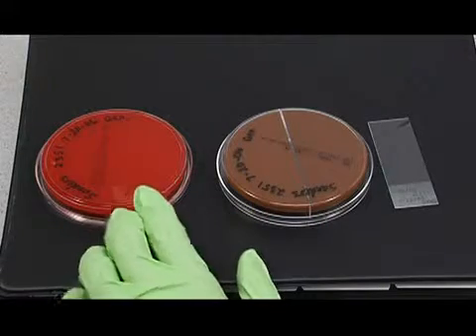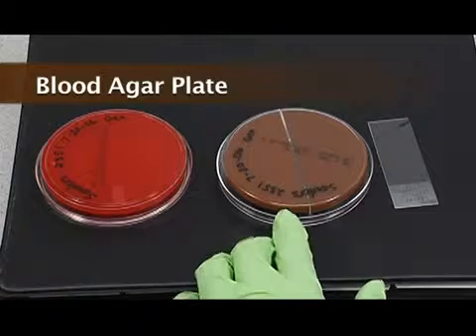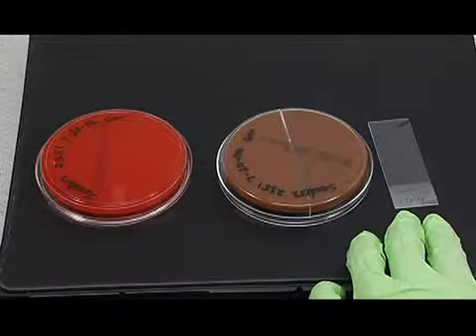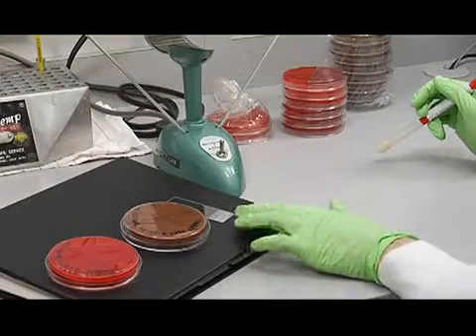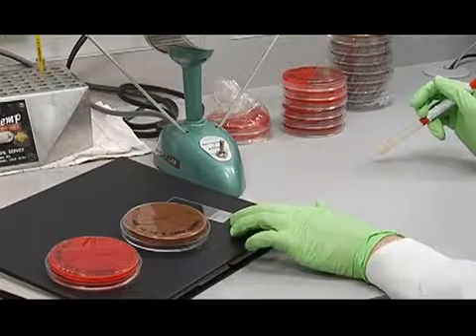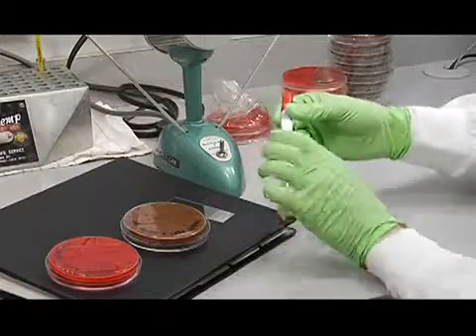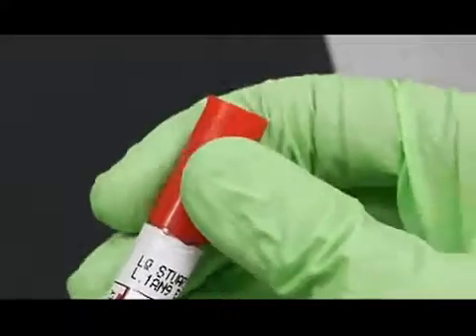So we're going to set this female genital tract culture on a blood agar plate, a chocolate agar Martin Lewis biplate, and we're going to make a smear on a slide. Make sure that we've labeled the media, and make sure you label your slide with a pencil so that it doesn't wash off during the staining process. And we're going to set this up from a genital swab. So take the swab out of the holder like this.